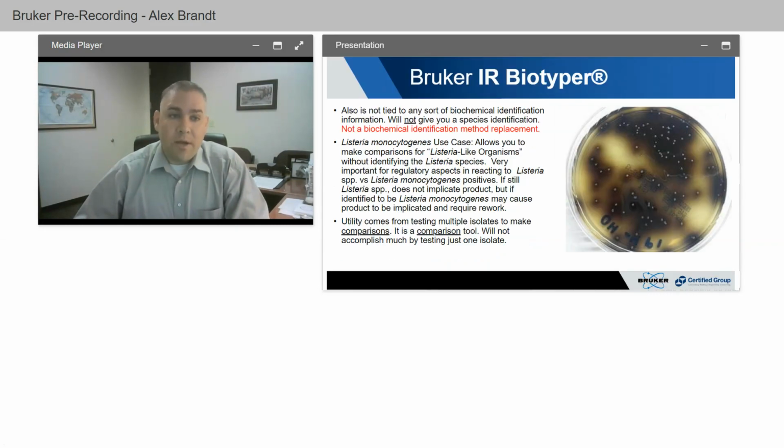Also, the Bruker IR Biotyper is not tied to any sort of biochemical identification information. It will not give you a species identification. It's not a biochemical identification method replacement. So think of methods out there like the bioMérieux VITEK, which gives you a biochemical identification. This technology does not do the same thing, and it will not give you an identification of a species, which is actually good in some cases.